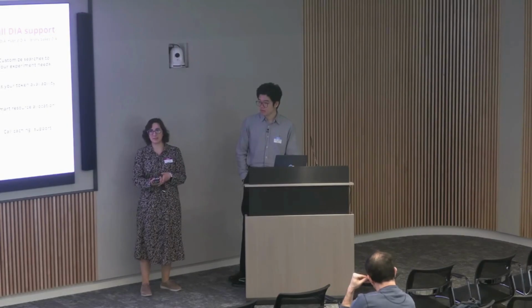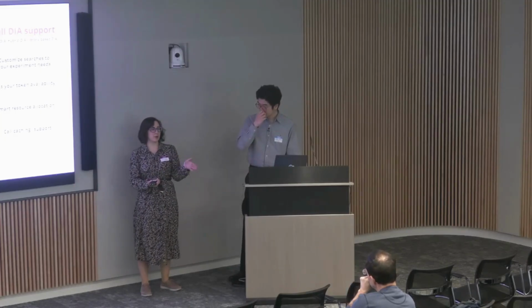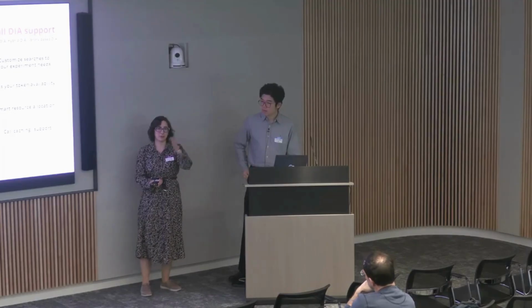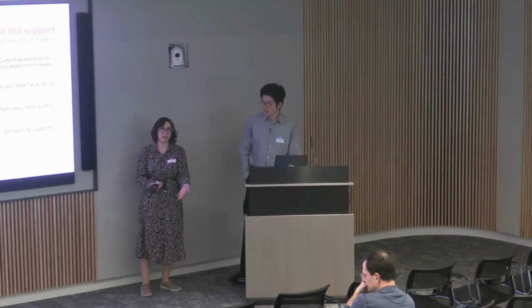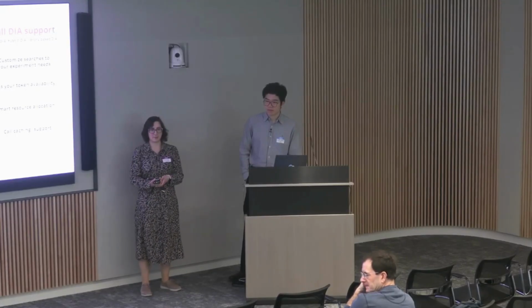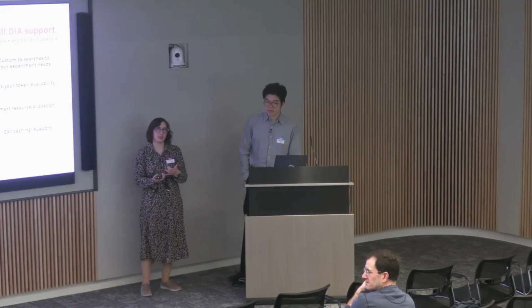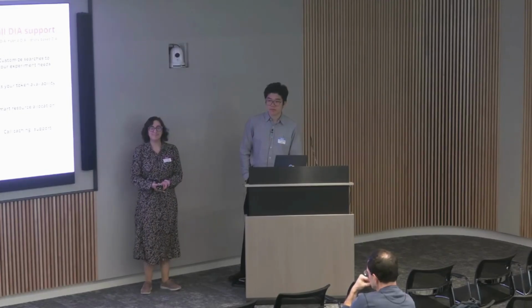We also did some tests showing that when you partition the files into the VMs, it's always the same. If you run the job again, you're always going to have the same files partitioned in the same way. And we made sure that no matter how many VMs or files per VM you use, your results are going to be consistent. That has to do with the updated architecture that Cameron talked about, which ensures that no matter how many tokens or seats you're using, your results are consistent. I see. Thank you so much.